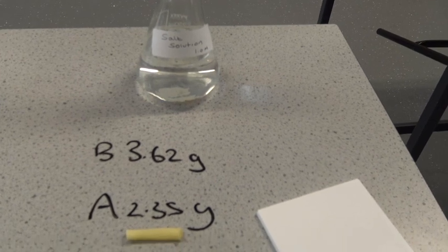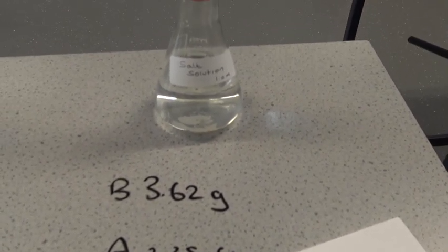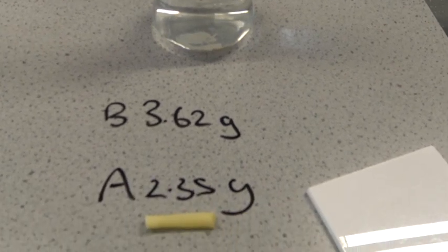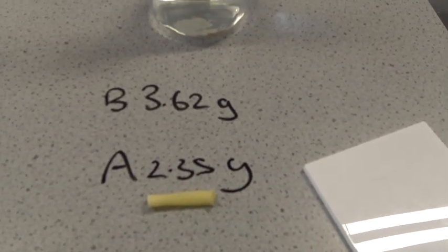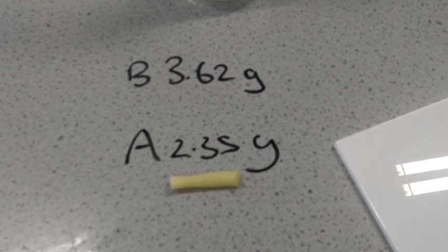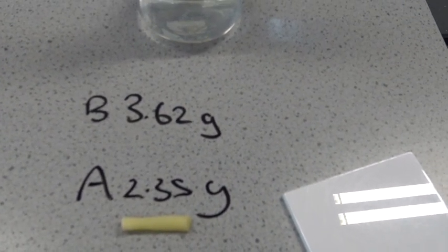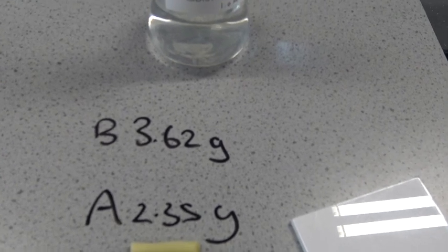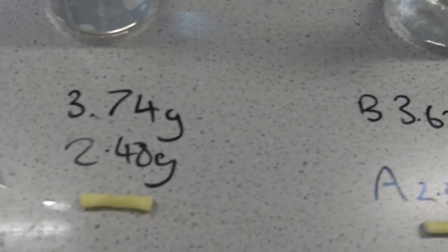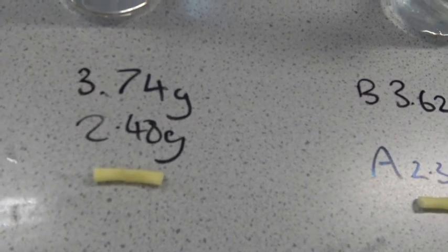So I have reweighed the potato chips. Look at this one — the one molar salt solution chip. It's a shadow of its former self. If we go down all the way to the potato that's been in the water, you can see how swollen that one looks compared to this. The one molar chip has gone down almost 1.3 grams. This one has also gone down by mass quite a lot as well.